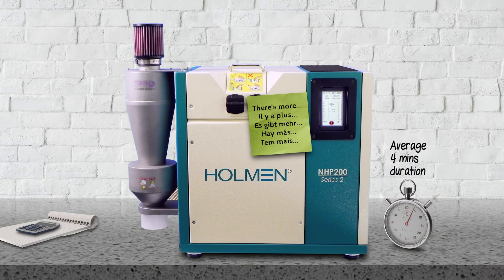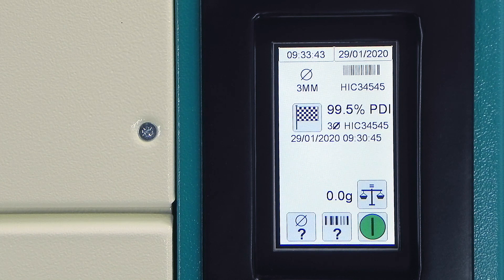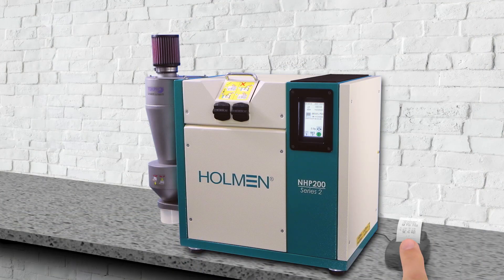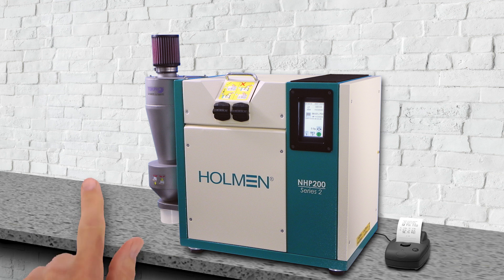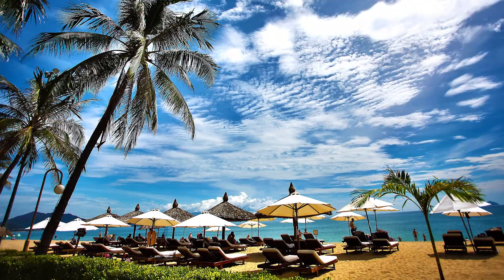But it does more. When it's finished, it stores the results and displays them on its color LCD touchscreen. They can be printed off or sent to other software for additional analysis. It can even email the results to the factory manager wherever they are, even on holiday.